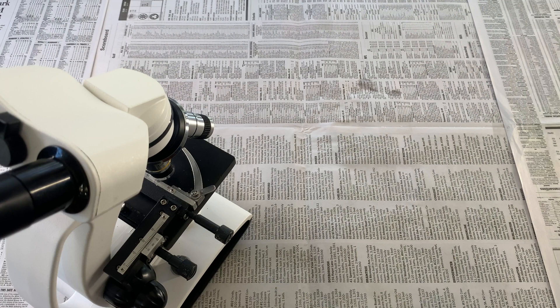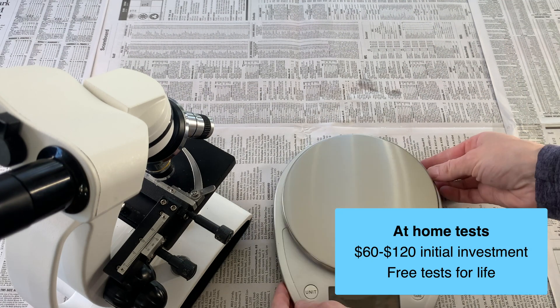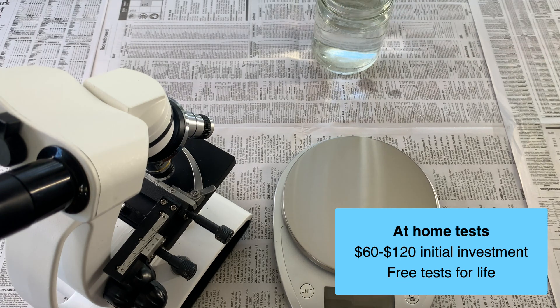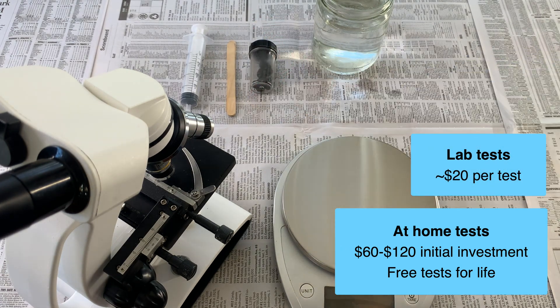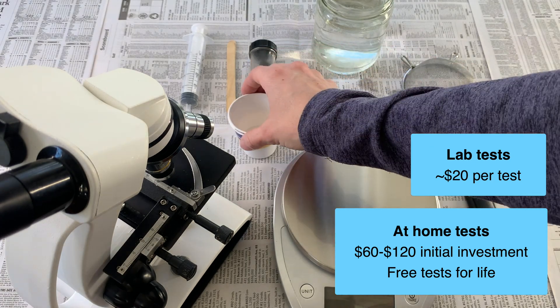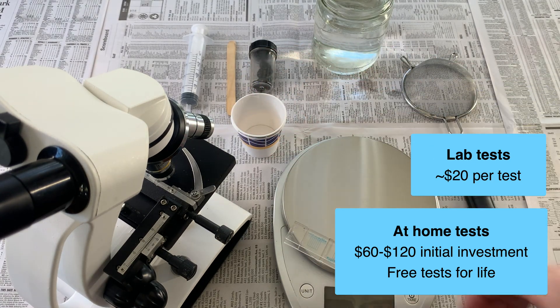You can get all the supplies you need for fecal tests, including a microscope, for about $120. If you can find a used microscope, you could probably cut this cost in half. Alternatively, you can send samples to a lab for about $20 a test. But if you have multiple animals and want to test multiple times a year, you can quickly see how the investment in doing at-home tests pays off in the long run.